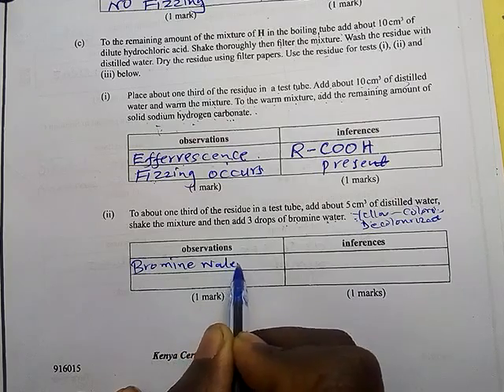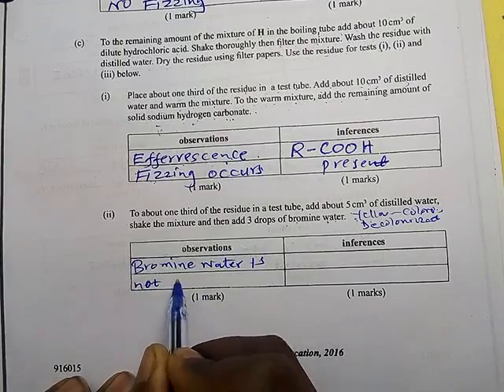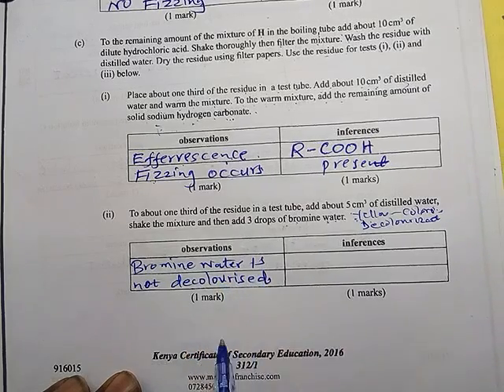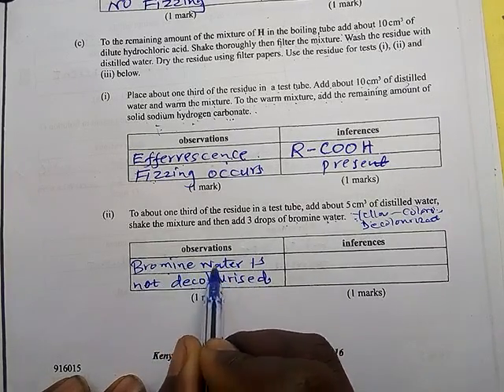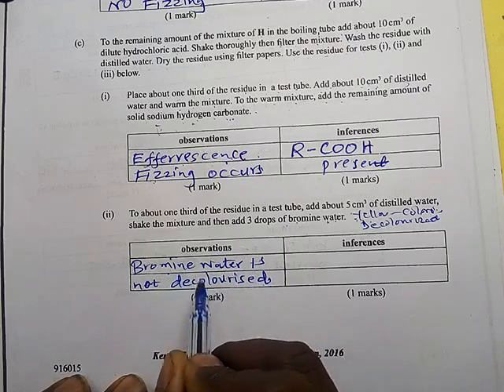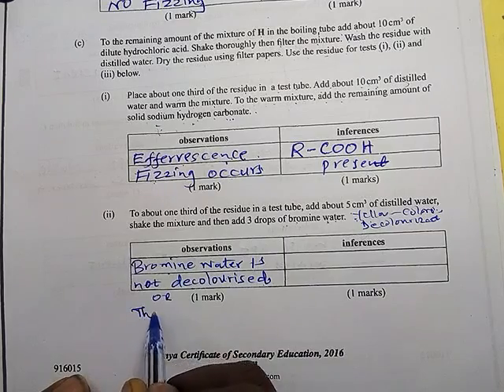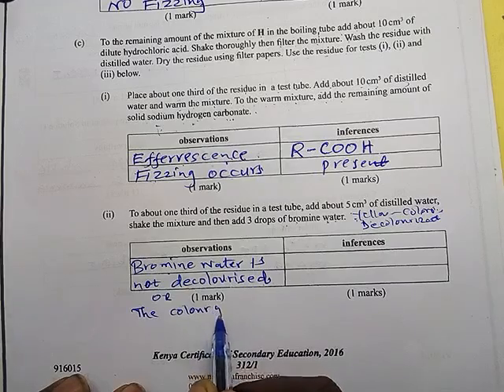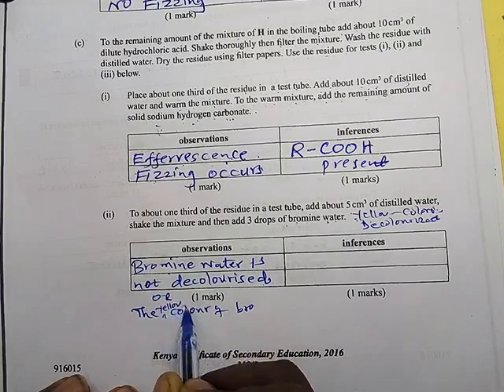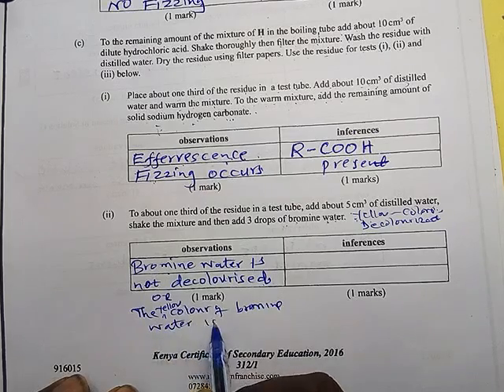So what was the observation here is that bromine water is not decolorized, meaning that the color of bromine water did not change from yellow to colorless. The yellow color of bromine water is retained.